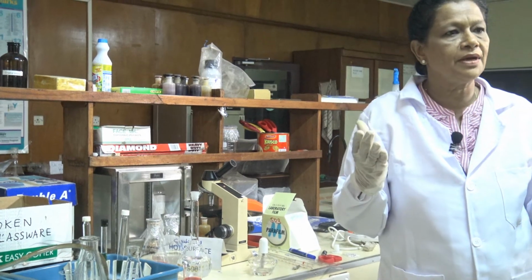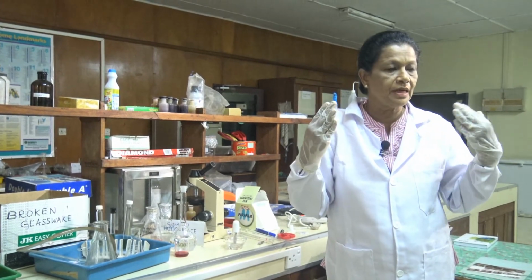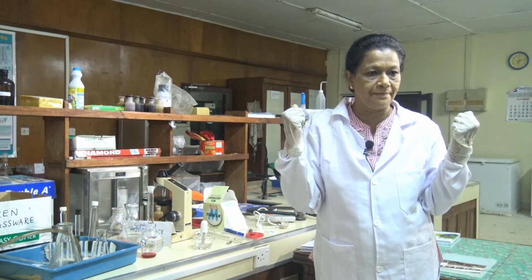If any chemical spillage occurs onto your skin or your eyes, immediately flush it using running water for at least 20 minutes. And before leaving the laboratory, clean the workplace and wash your hands properly using soap.